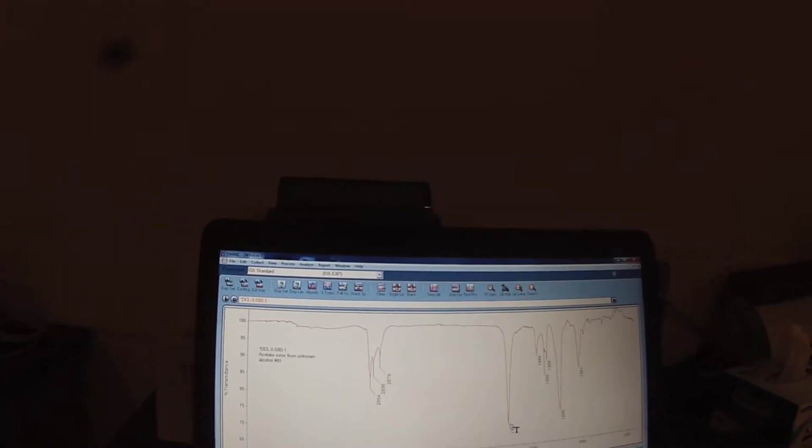And we'll move these so that they're nicely visible, out of each other's way. So that looks really nice. I'm going to save that. And I'm going to print it.